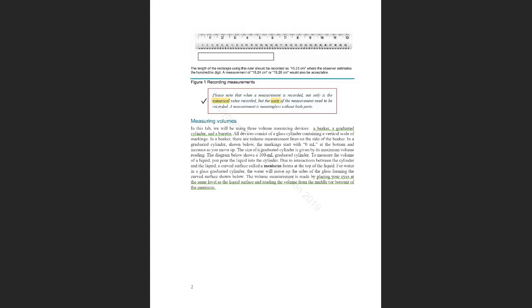How are you going to measure? What is the first thing you need to do? You always have to look at the two closest lines, what length it represents. In our case, it represents 0.1. I want to make sure that is clear. Everybody sees that. Let me make it bigger.